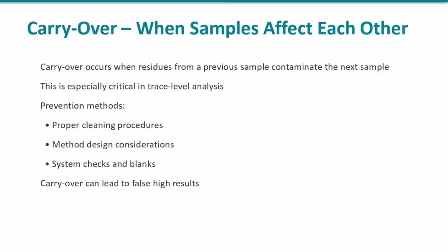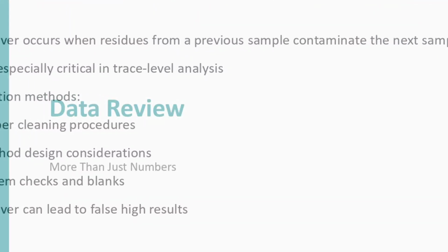Another challenge is carryover. Carryover occurs when residues from a previous sample contaminate the next sample. This is especially critical in trace-level analysis. Proper cleaning procedures, method design, and system suitability checks are used to minimize this risk.